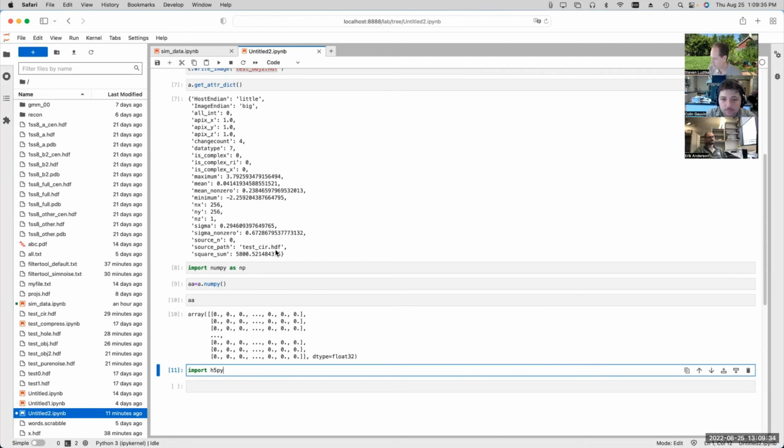Once you extract the per particle movie stacks, those per particle movie stacks are a lot smaller than the overall frame movie stacks, right? So you can start saving a little bit of space in your local file system that way.